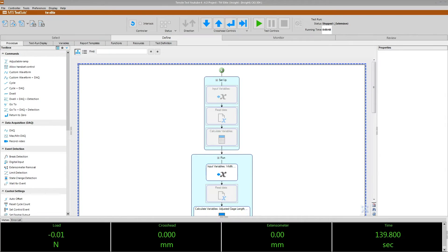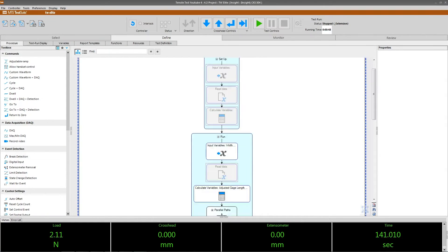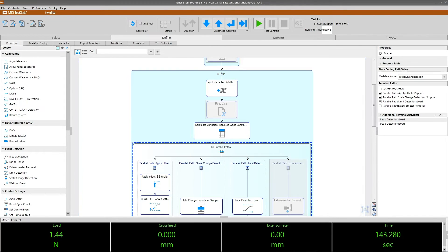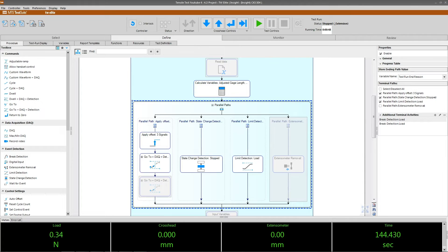Now that the test is set up, we have to set up the software. Today we will be using MTS Test Suite. We will be using the pre-made template EM Tension Simplified. Each of these boxes represents a command. As we work our way down the procedure, the command gets more and more complex using parallel paths for things like brake detection and data acquisition.